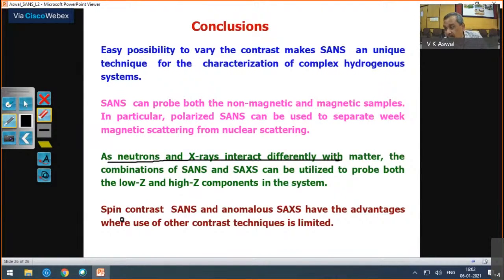Sometimes it can be a charge which can make the particles come together or go away. So there are various kinds of interactions which will make these conglomerations. And you are looking at this not at the atomic level, but at a conglomeration of particles and molecules, in the length range, as Dr. Aswal said, of say nanometer to hundreds of nanometer. That means tens of angstrom to 1,000 angstrom. Please keep it in mind. We are talking in terms of conglomerations, particles which are in a medium, contrast.